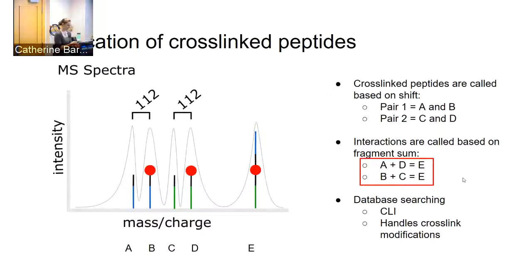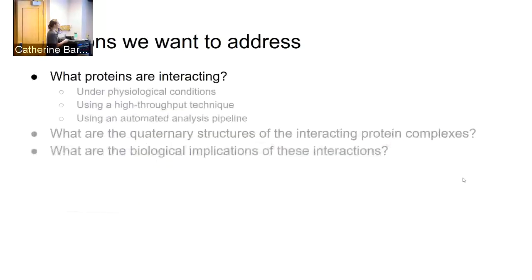Maybe, okay. Okay, so this is like a big part, so I just want to make sure, do we all follow how we identify crosslinks, or do we have any other questions? Cool. Right. Okay, so that allows us to identify which of the proteins are interacting, and that output is usually just some kind of spreadsheet with, oh, you have this peptide and that peptide, and they're connected to these proteins.